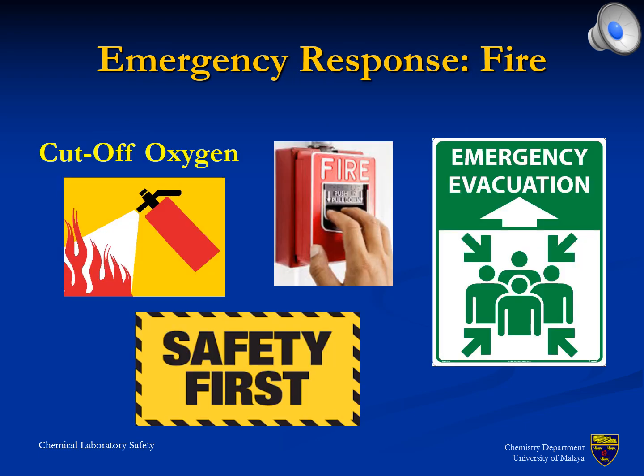Fire in a chemical laboratory should be addressed immediately, before the fire exceeds the size that can be handled by non-professionals. For any firefighting, however, personal safety is of highest importance. In case of doubt, it is recommended to flee rather than to fight. However, in this case the alarm must be raised to ensure a proper evacuation and prevent damage to others due to the fire. Please move to the assembly location for the respective building to avoid anyone taking a risk in order to save you, when you have already left.